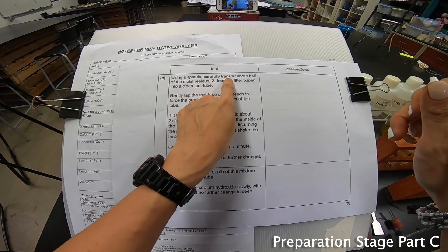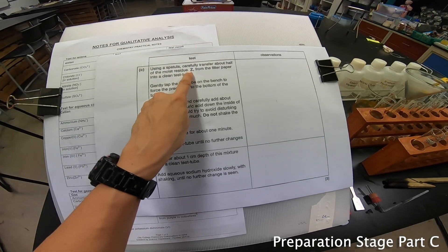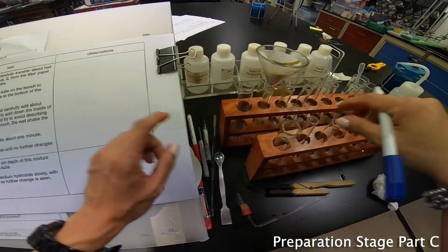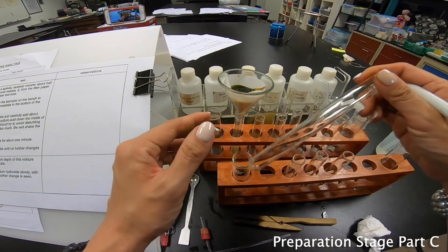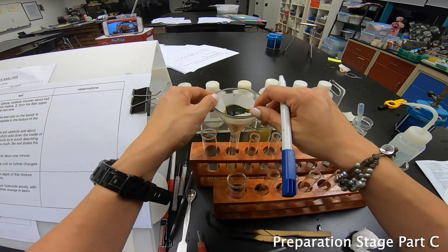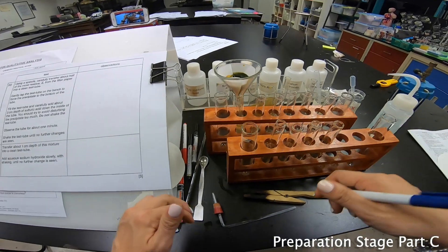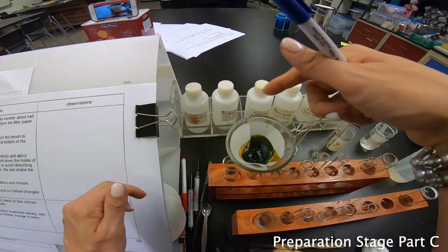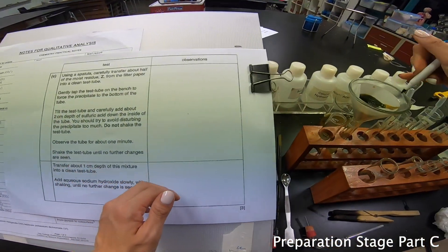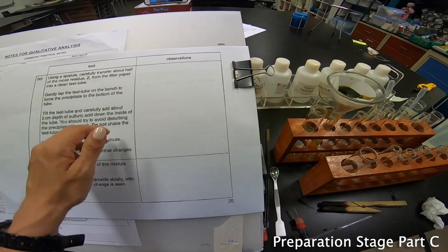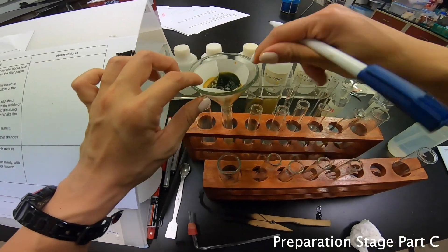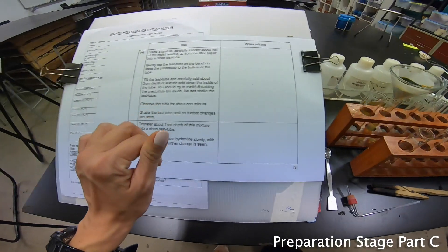Using a spatula, carefully transfer about half of the moist residue Z from the filter paper into a clean test tube. So I have a clean test tube over here, and this is my moist Z. Can you see that Z is actually a dirty green, very dirty green residue? But the side here is actually yellowish brown.